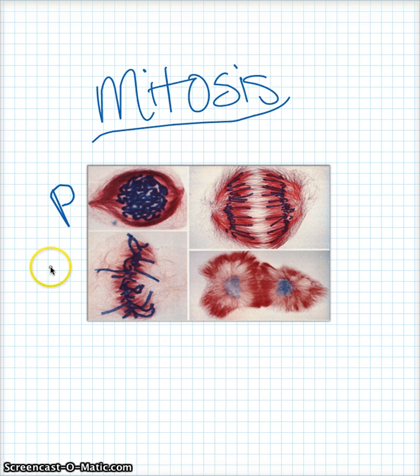And then, metaphase is the second one here. You can tell it's metaphase, because all of the chromosomes are lined up right in the center, in a nice little line.